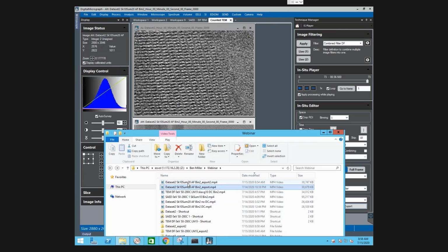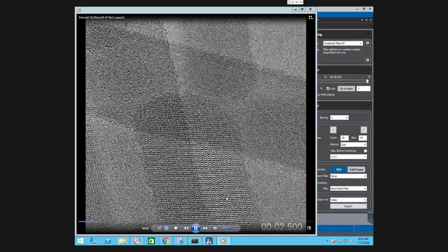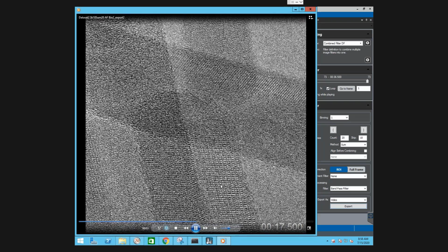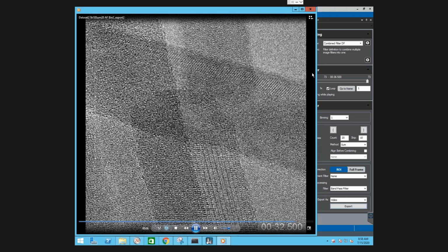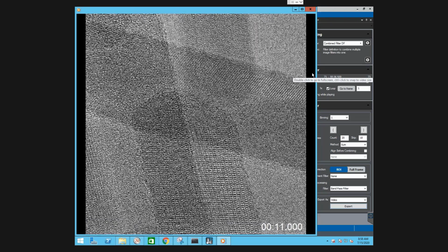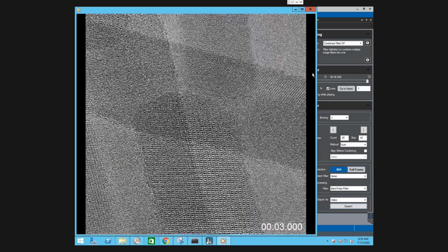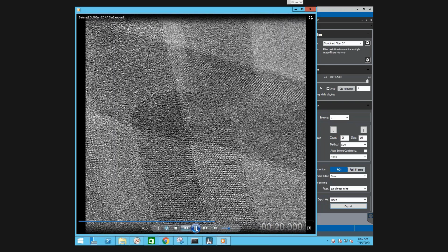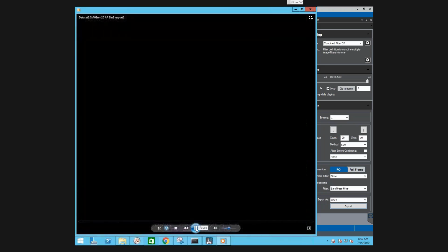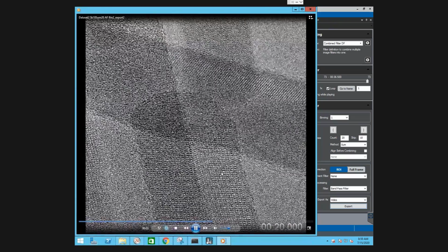Okay, so that's done. Here it is. And oops. So we can maybe see that playback. It's awfully jerky on my monitor, so it's probably even worse for you all, and I apologize about that. But if we were not looking at this over TeamViewer, this would look quite fabulous. There it goes. Maybe that's a little bit better.